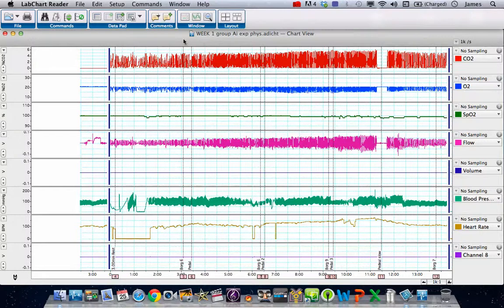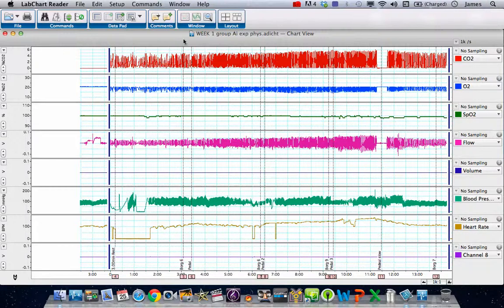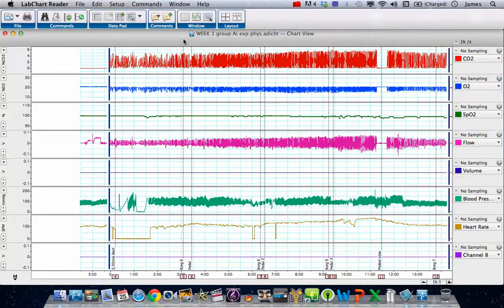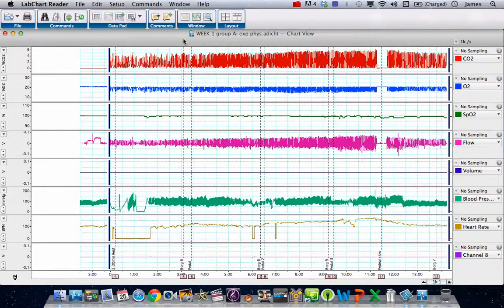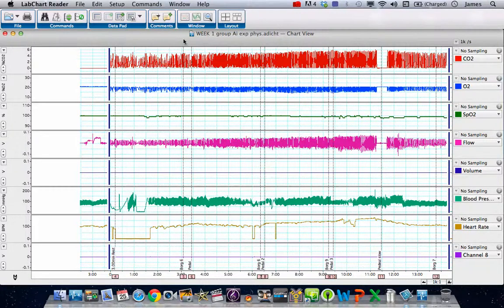The intention of this tutorial is to show how we can recalibrate the spirometry flow and volume channels on a recording that has been made previously in the laboratory using the spirometry pod. Bear in mind, the LabChart Reader software doesn't support the spirometry pod, so we're going to work without it in this instance, recalibrate the data, and recreate the file that we had originally.